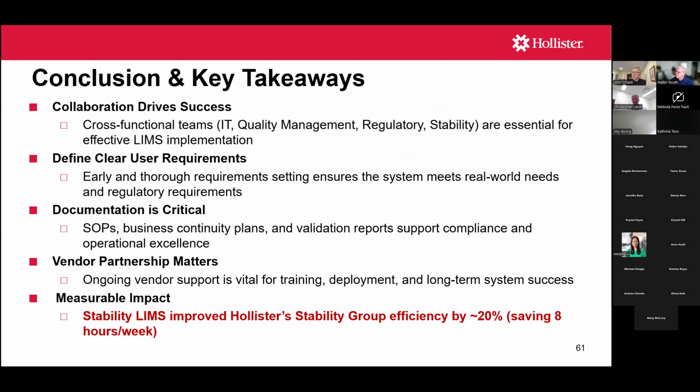Again, perhaps the most important step is really defining your user requirements. Coming together with that cross-functional team, make sure that everybody has a say in what they need the system to do. And again, breaking your user requirements into the mandatory required as well as optional requirements.